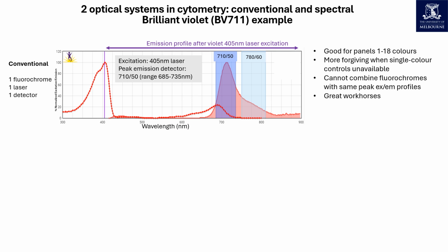where peak emission is measured. While BV711 emits photons that are outside of this bandpass range, both shorter and longer wavelengths, these emissions are not included in its fluorescence measurements, and mathematical algorithms are used to remove or compensate them out of adjacent detectors.